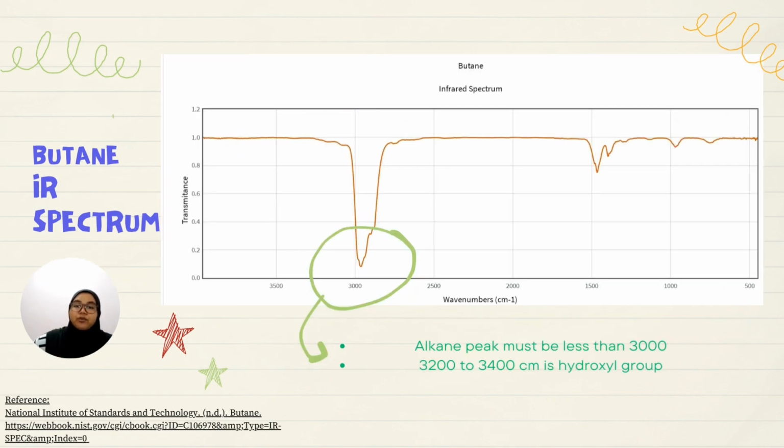There is a way to read the infrared spectrum. Firstly, we need to know the two peaks that are contained in an infrared spectrum. Firstly is the carbonyl stretch, with a sharp peak at 1700, and another peak is the OH stretch, which is a broad peak at 3300. As we can see here, our first peak is below 3000.